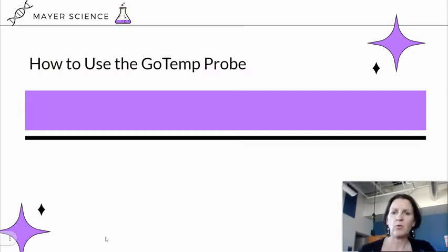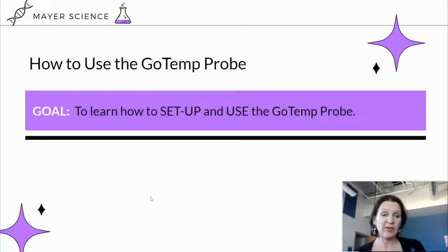This short video will show you how to use the Go Temperature probe. Our goal here is not only to learn how to set up the probe, but also how to use the probe and access the data so you can insert it wherever you need it to be.